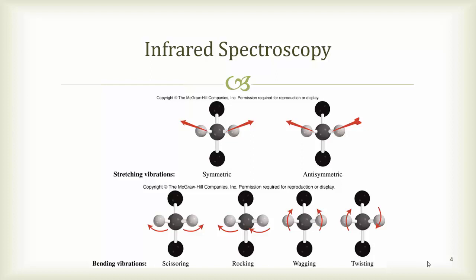With IR spectroscopy, we are looking at atomic vibrational motions. IR light energy absorbed by organic compounds does not have enough energy to cause electrons to jump orbitals. It just causes vibrational motion, such as symmetric bond stretching, asymmetric bond stretching, symmetric bending, and asymmetric bond bending, as examples. IR spectroscopy exploits the fact that molecules have specific frequencies at which they rotate or vibrate.